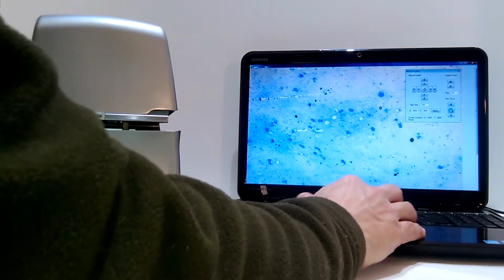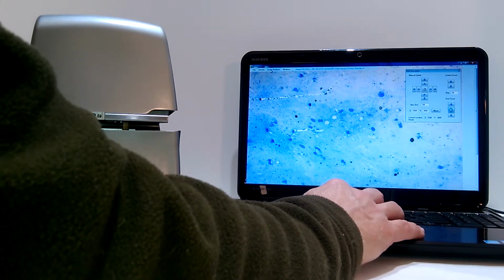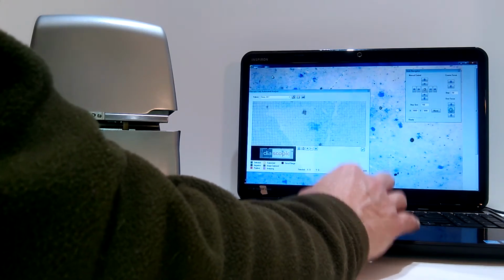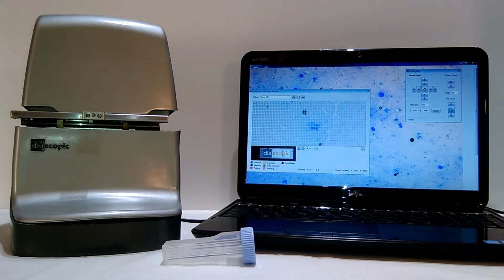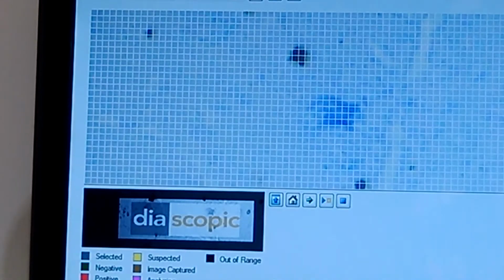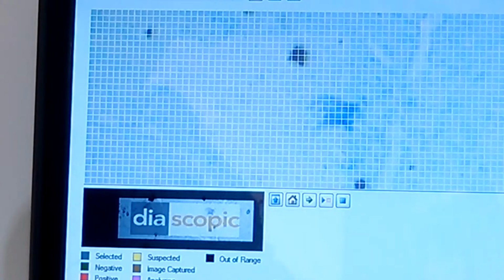And then I want to show you fully automated analysis, which is our single slide automated technique. So I will open a utility here. I want to zoom in as well so that you can see what we're looking at. And you see here a light blue rectangle that is broken up into this array structure. Each of these white blocks in this array represents a field of view. And again, this is a field of view.